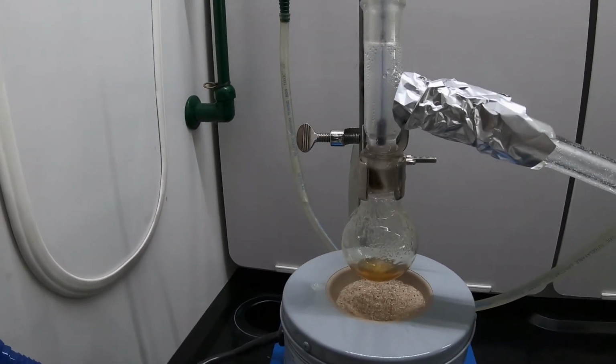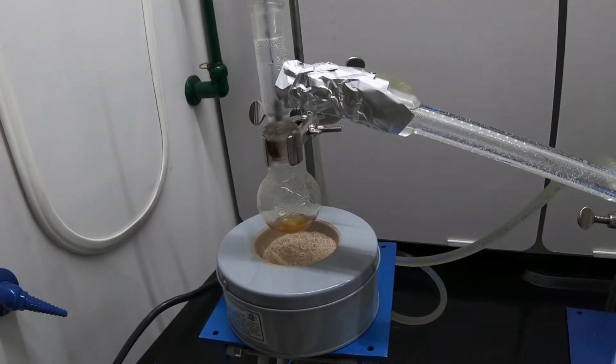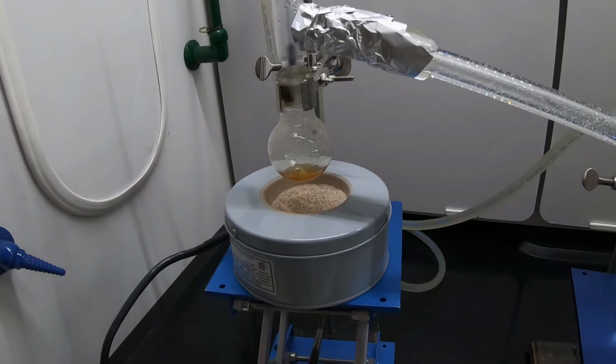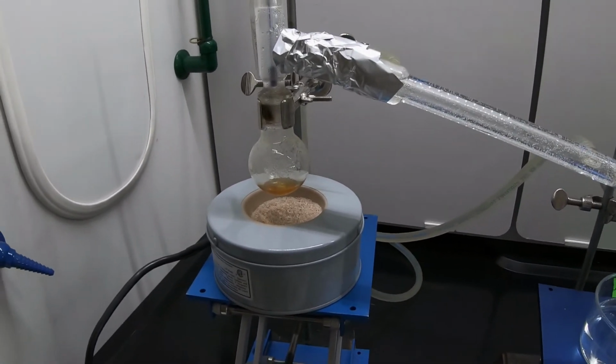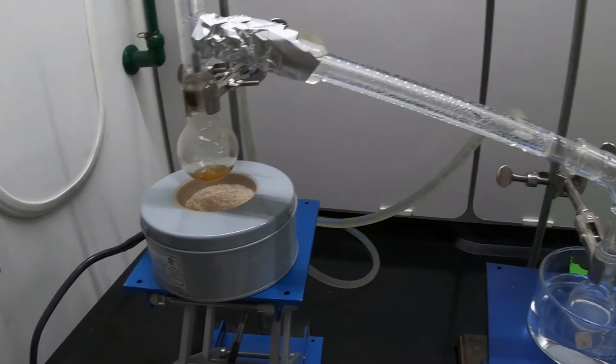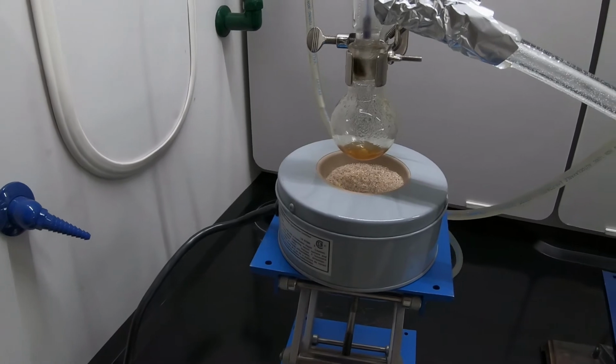Temperature is continuing to drop. It's apparently about 82 degrees, 83 degrees, and we're going to consider this reaction done. I believe most of the material, if not all of the cyclohexenes, have been distilled over. What remains is a polymerized version of the various alkenes.